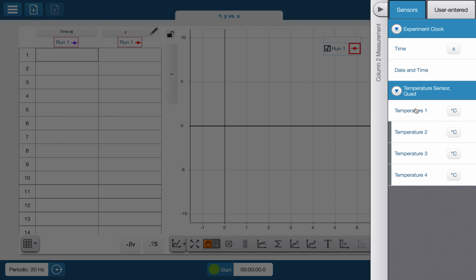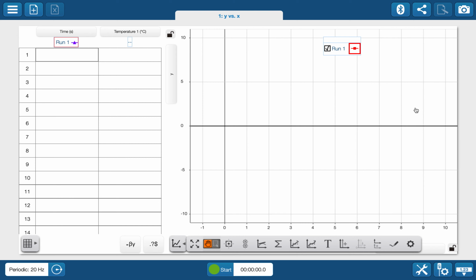And this depends on what you've already attached to your computer. Each of our data logging controls have got 4 different positions for you to handle or put probes into it. So make sure it's the right one you are clicking on. In this case, I can see that the only one that is really an option for me is temperature. And it's in position 1. You should check your control box before you go on with that.